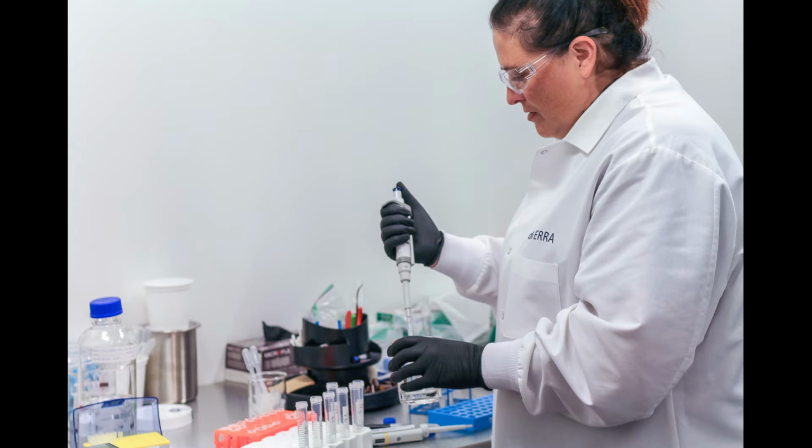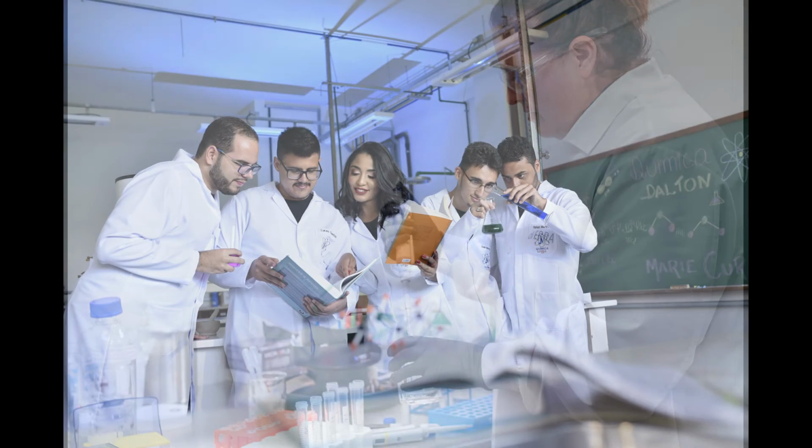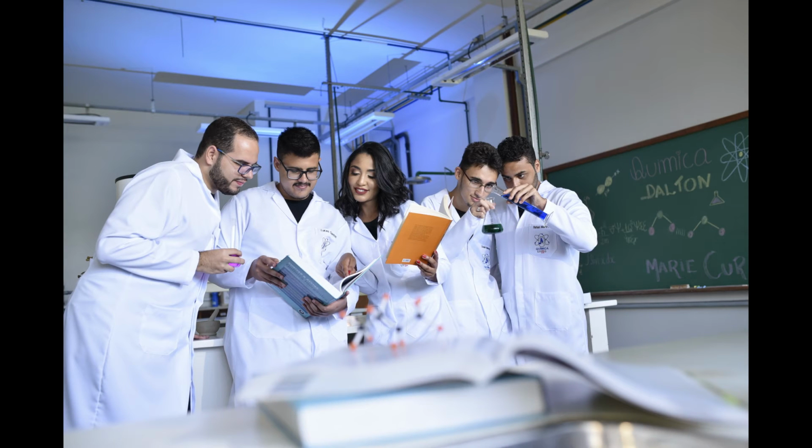The work surfaces should be decontaminated daily, if not more frequently. As mentioned, there should also be the fairly standard rules, such as no drinking, smoking, eating, your fairly common sense practices. After all, who wants to have a mouthful of E. coli covered sandwich in the middle of a laboratory?